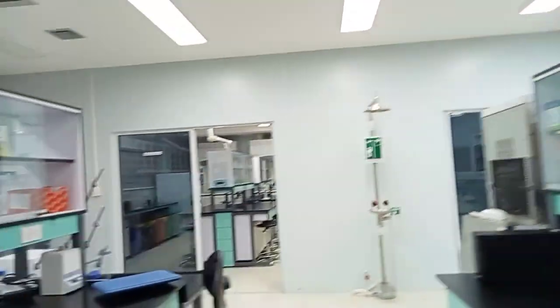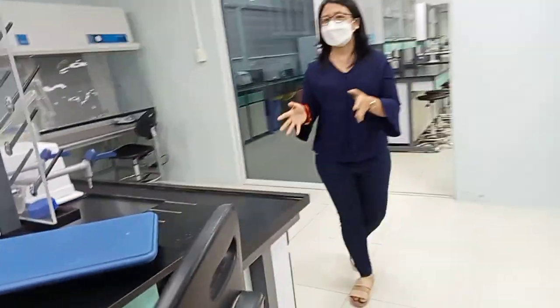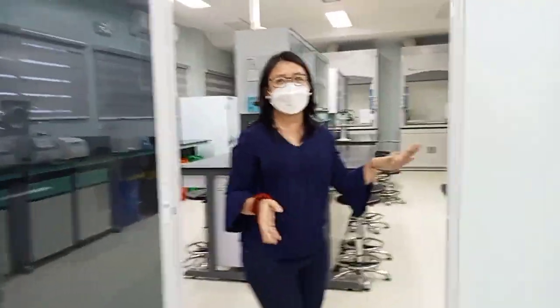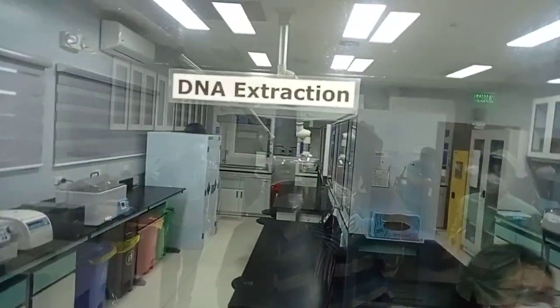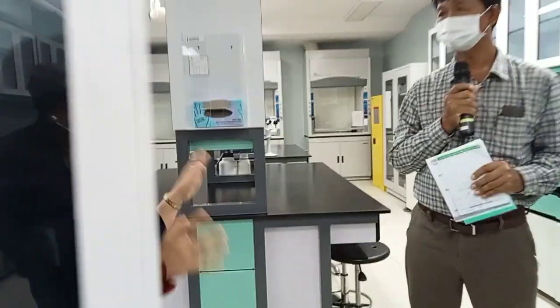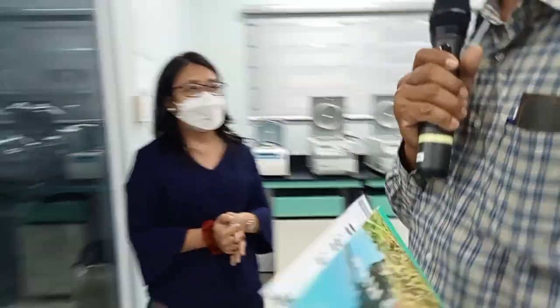Alright, so welcome to the lab. Okay. Molecular genetics lab. So here we do our DNA extraction in this room. So everyone has to be under a hood. So we do our DNA extraction. Any samples that we have, but usually we use rice for now, although this center is open for other crops.